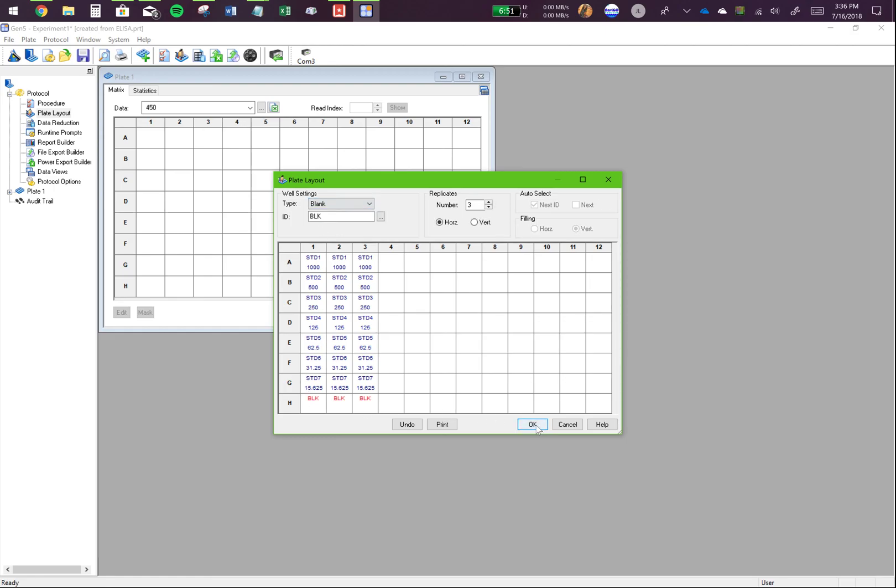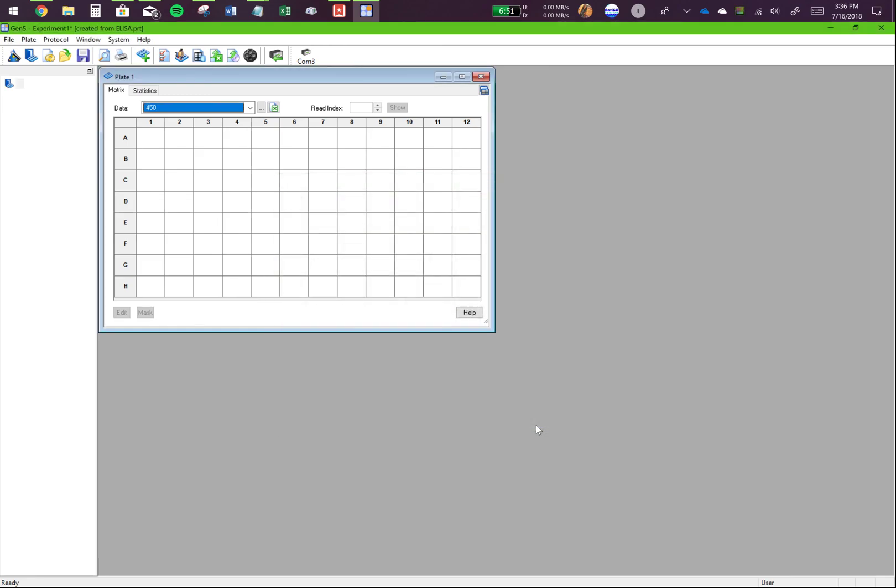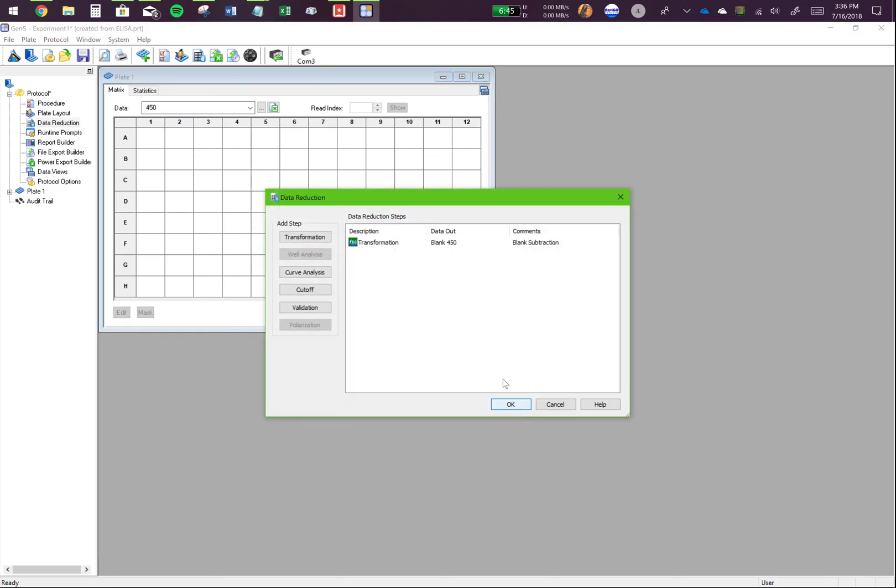And that's my standard. So I have set up my plate layout. However, when you are running standard curves, you want to make sure about another special parameter that's called data reduction. Data reduction is what's going to help your program interpolate the values of your unknowns using the standard curve.